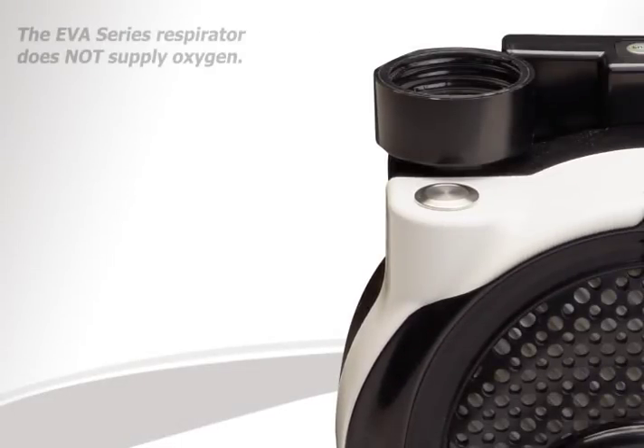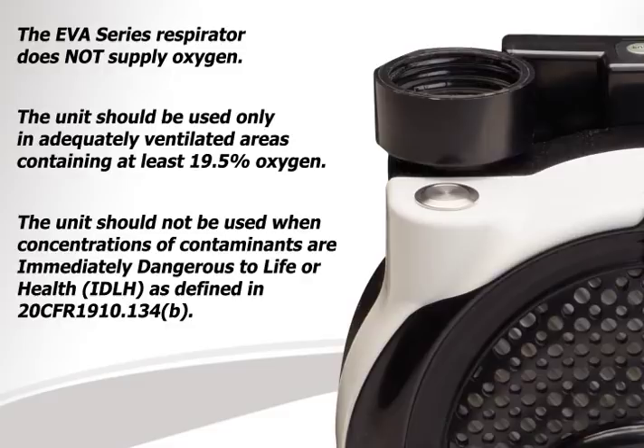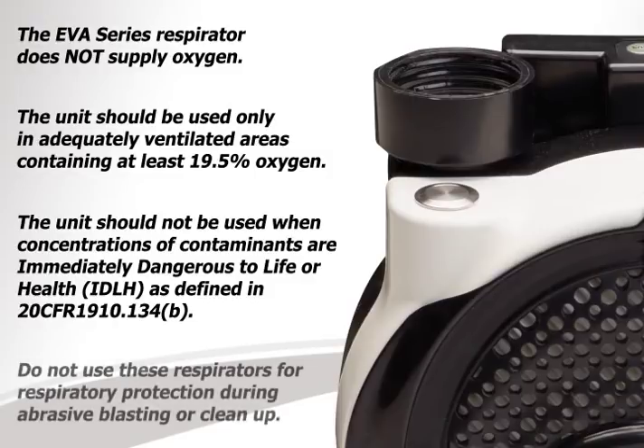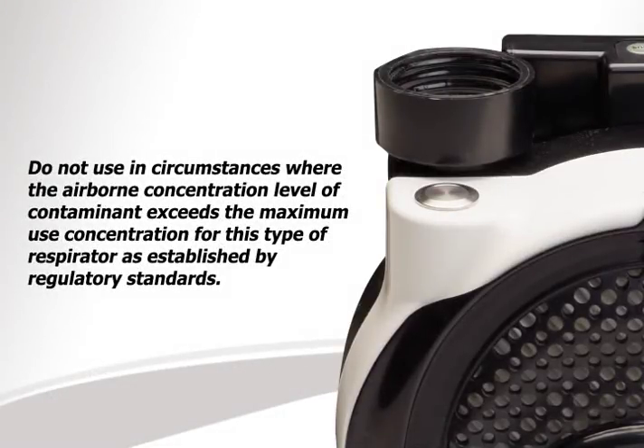Users of the EVA PAPR product should note the following. The EVA series respirator does not supply oxygen. The unit should be used only in adequately ventilated areas containing at least 19.5% oxygen. The unit should not be used when concentrations of contaminants are immediately dangerous to life or health (IDLH), as defined in 29 CFR 1910.134. Do not use these respirators for respiratory protection during abrasive blasting or cleanup. Do not use in circumstances where the airborne concentration level of contaminant exceeds the maximum use concentration for this type of respirator, as established by regulatory standards.